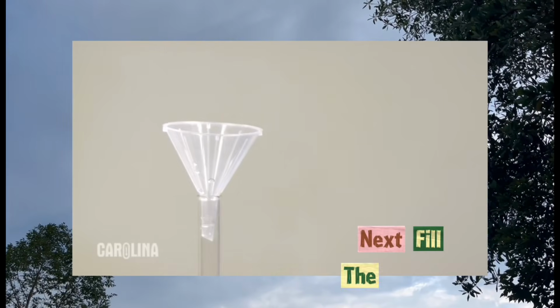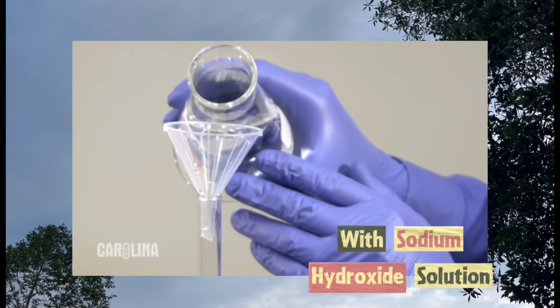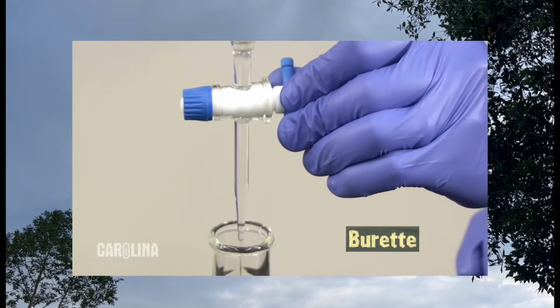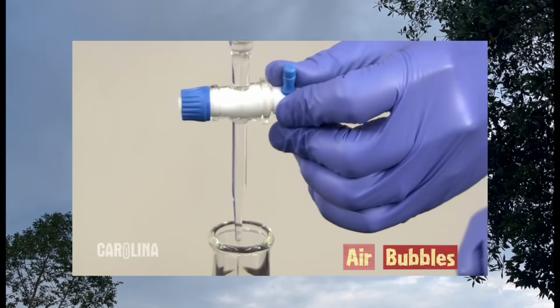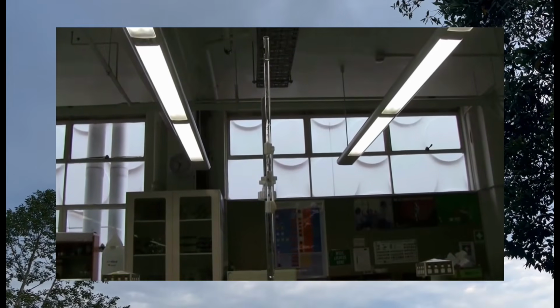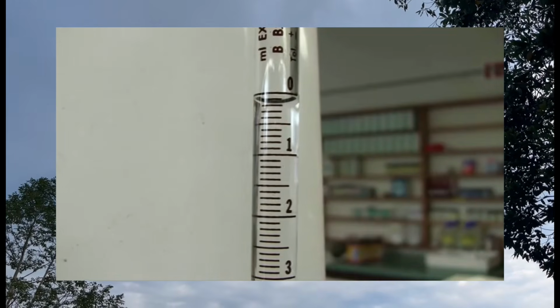Next, fill the burette with sodium hydroxide solution. Let some of the solution run rapidly from the burette to expel all air bubbles from the tip. Add more sodium hydroxide solution until the 0 ml mark.